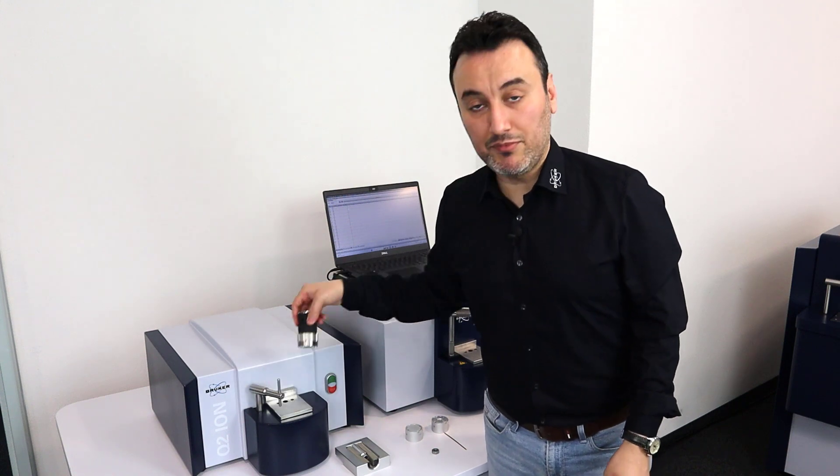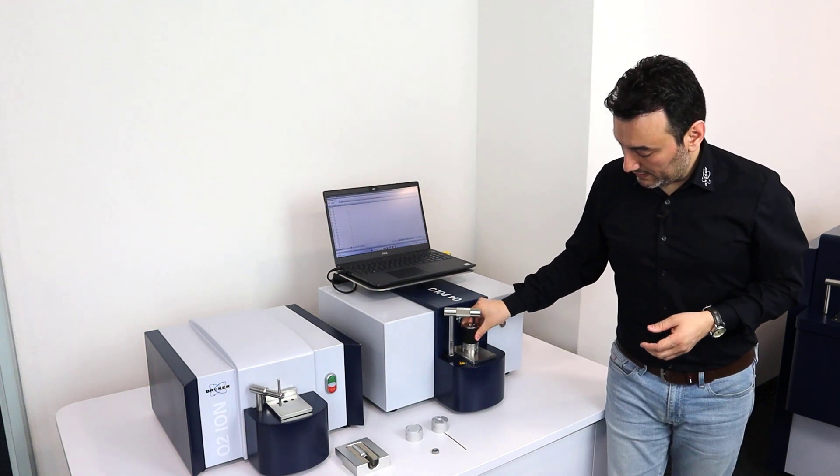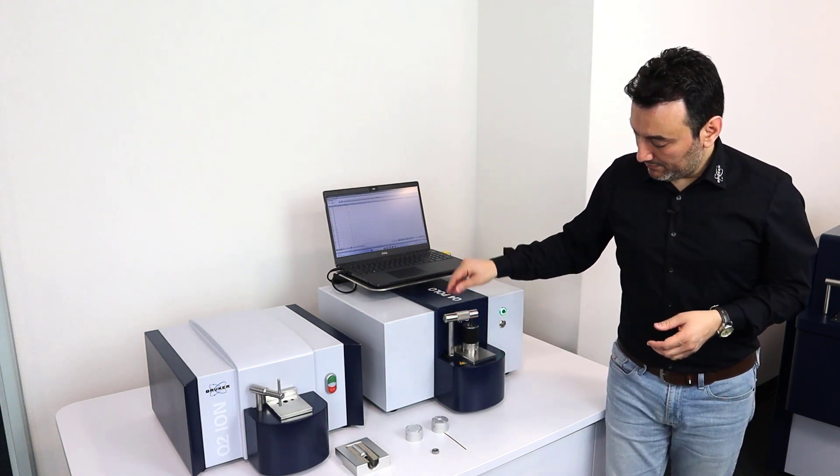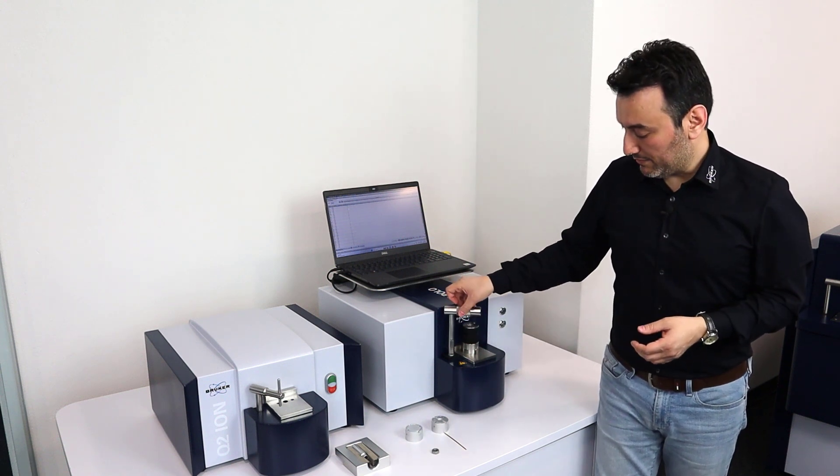This adapter is also compatible with the Q4 Polo. I can place it in here, put the clamp on it, and the system is ready to run the wire sample.